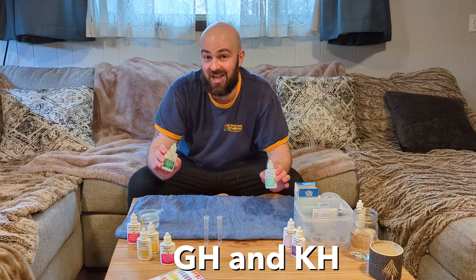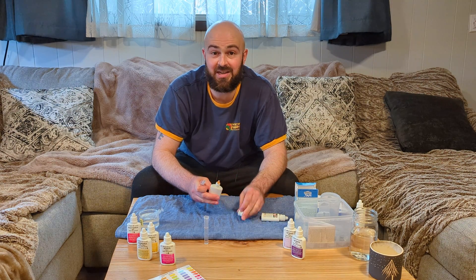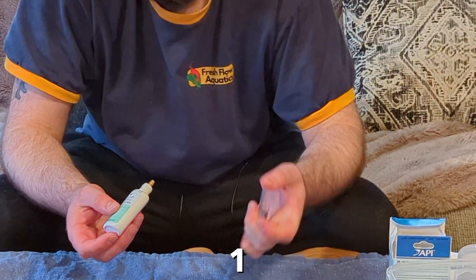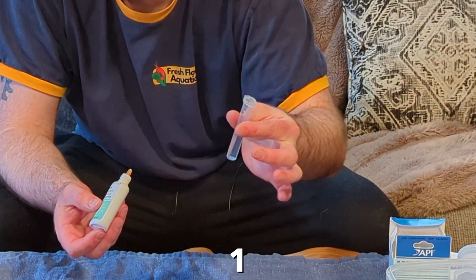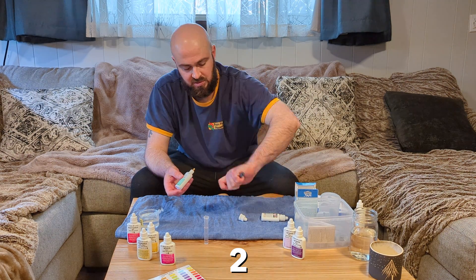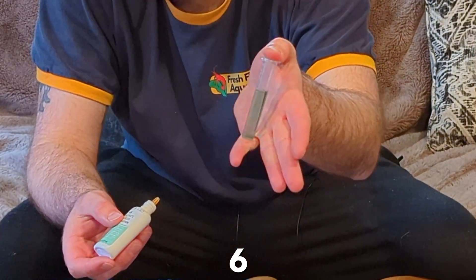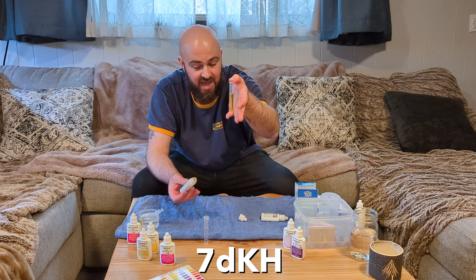Let's take a look at the GH and KH test kits now. Starting with the KH, what we want to do is add one drop at a time and stop when it turns completely yellow. After each drop, flip it over a few times and check if it's still blue — if so, keep going and count how many drops you add. At seven drops it turned yellow, so we have a KH of seven.